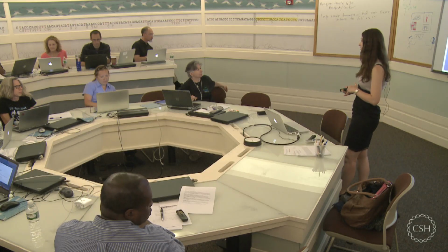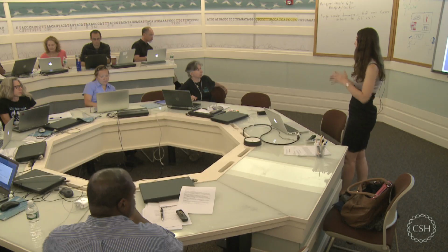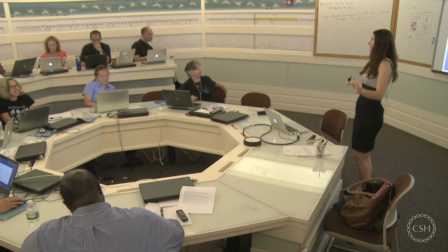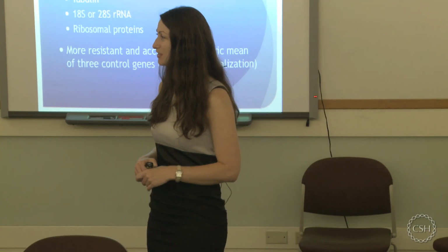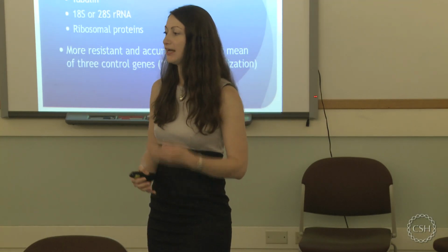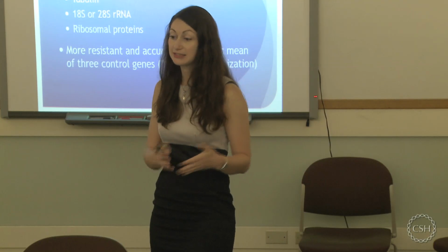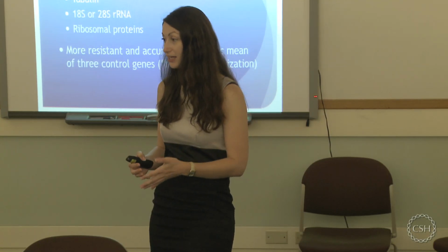Nowadays, there's a lot of publications out there which you can read up on which genes are stable in which tissue. At least definitely that's the case for human, mouse, hamster, and so on. I'm sure not likely for bees. That I don't know. But there are a lot of publications out there where people checked which genes are expressed stably and accurately across tissues and across organisms. You can definitely start from there and try some of these. And if you then see they are still varying, just choose a different one. So maybe you want to start with 5, which you test, and choose the best 3 of them.